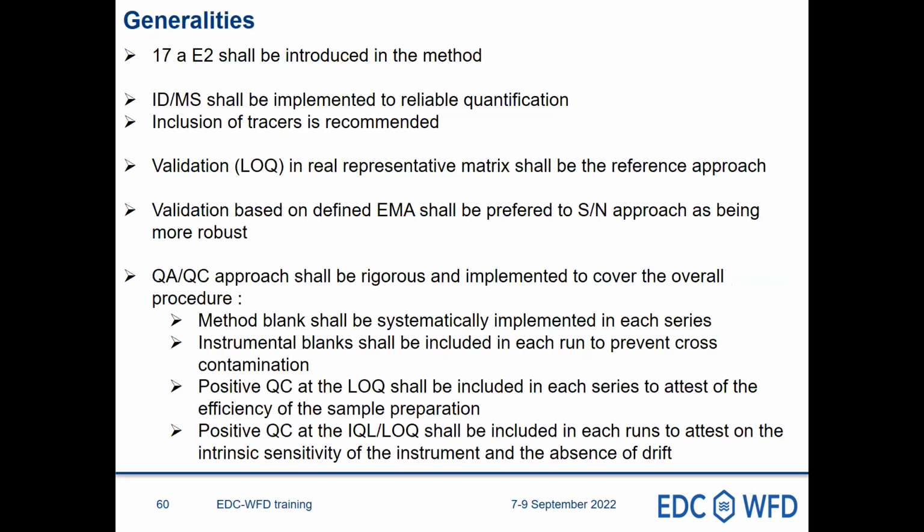17 alpha estradiol should be introduced in the method, really, otherwise there are risks of bad quantification. IDMS for us is totally mandatory if you want to have reliable quantification. And we furthermore recommend the inclusion of a tracer for the instrumental part to monitor your internal standard for quantification.